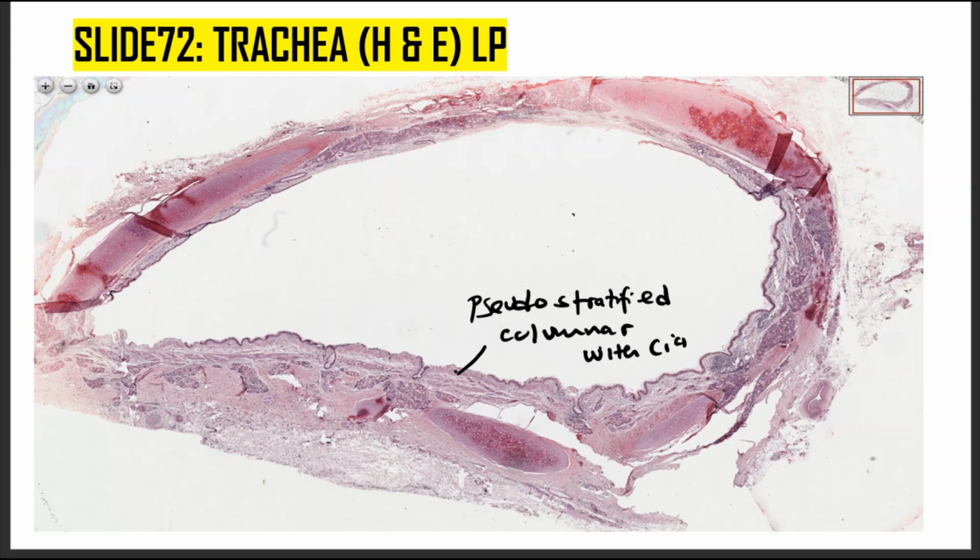So this is the anterior portion. And then posteriorly, you find an incomplete ring of hyaline cartilage. So this is hyaline cartilage. This is an incomplete ring because it does not meet with this hyaline cartilage here, because there's a disturbance. Here there's what we call a trachealis muscle.